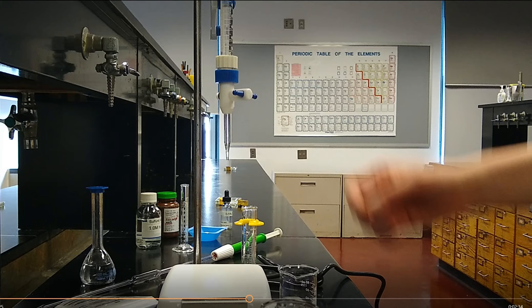In the example we've got, I measured an initial volume of about 0.75 milliliters and a volume final of 14.26 milliliters. As long as you've got it out to the hundredths place, you're fine. You don't have to agree 100%. We know the uncertainty is in the last digit.